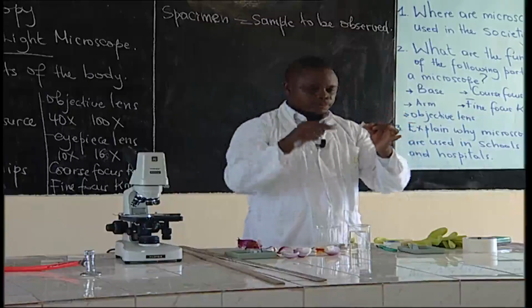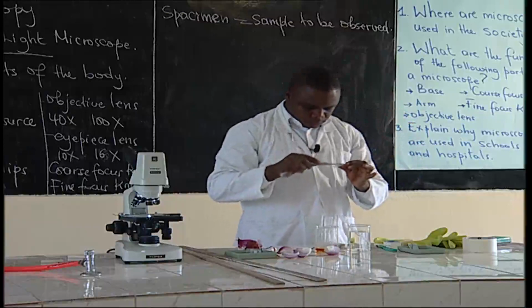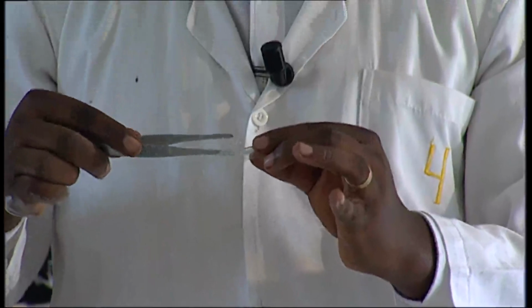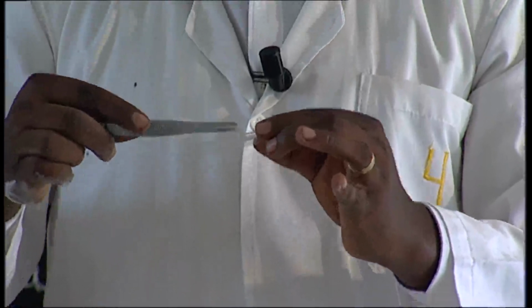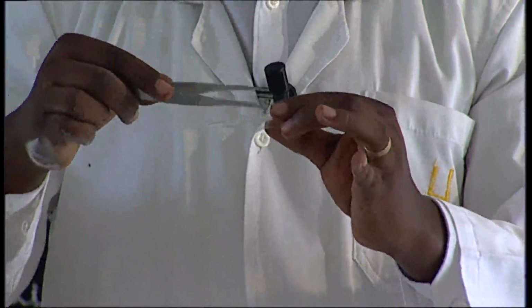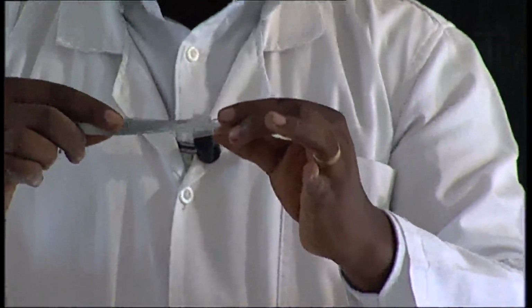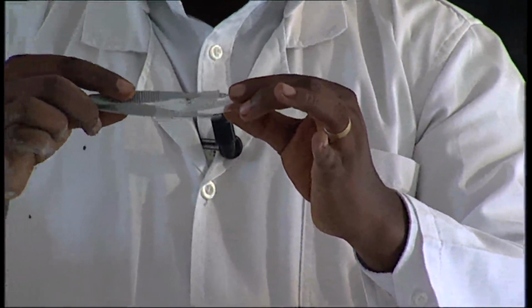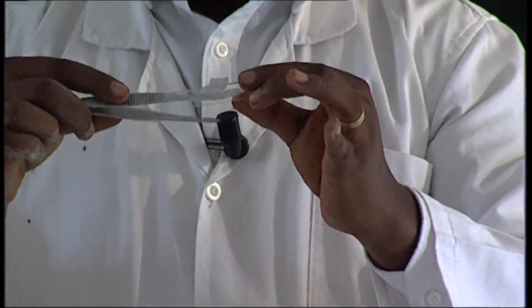I make sure it is flat. And the reason why I put there water is to avoid drying and wilting of the cells which make this membrane.